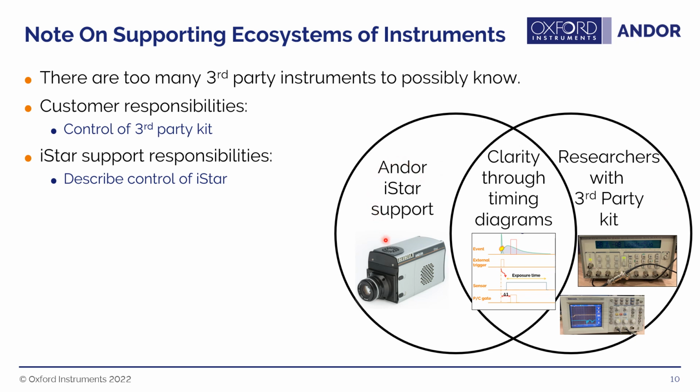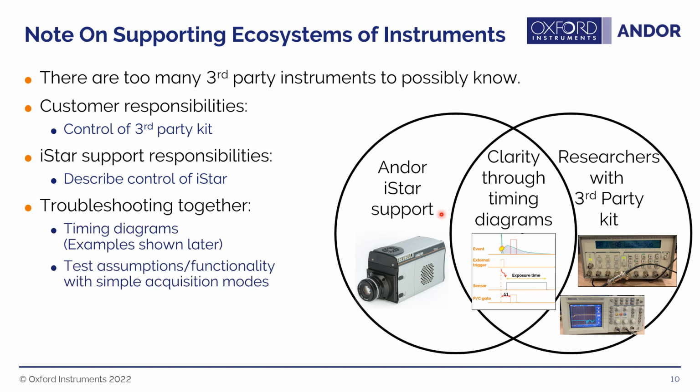So Andor's responsibility is to give support to explain how the iStar or other cameras work. And so in order to troubleshoot things or to help explain how to use the equipment to achieve a specific goal, we have to use timing diagrams. So I'll show some more examples of this later, but this gives us a common language where we know what timing is required for the iStars, as well as the researchers will know how to configure their instruments through discussing through timing diagrams of when the sequence of events should happen.